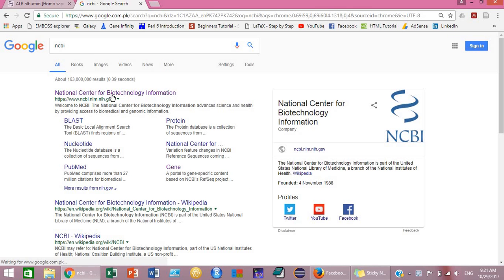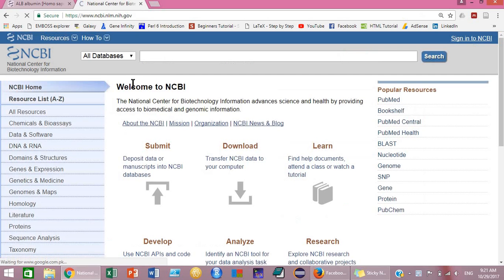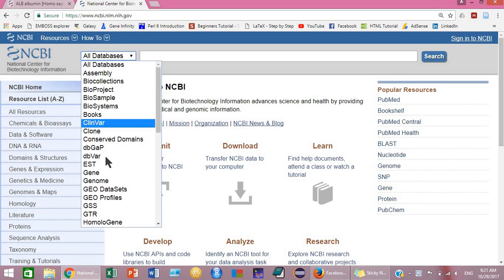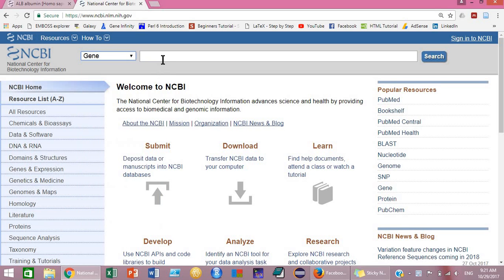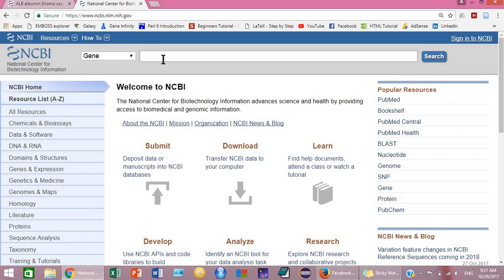Go to the NCBI website, select the gene database from here, and then search for a gene that you are going to design primers for. Suppose we are going to design primers for a human albumin gene.